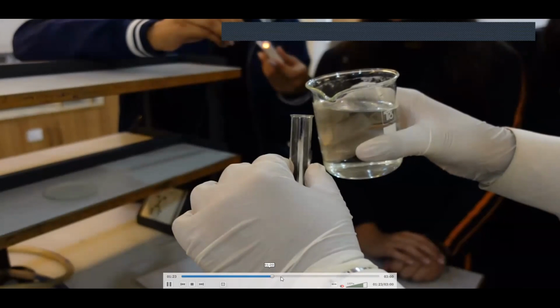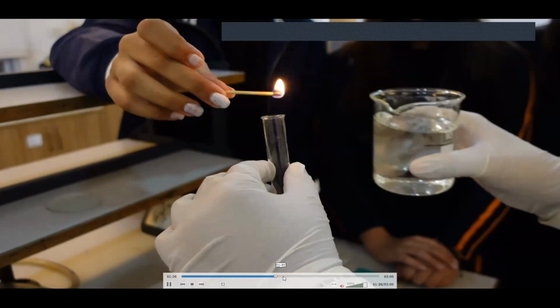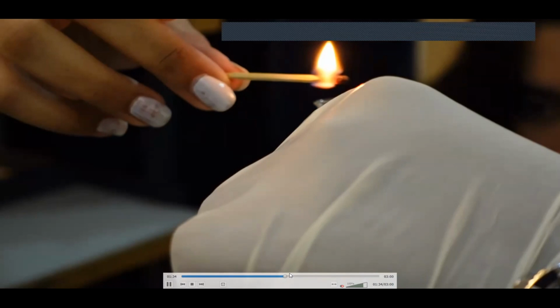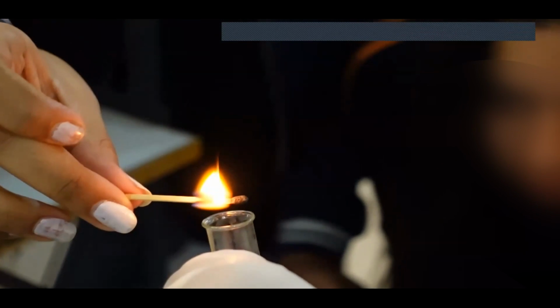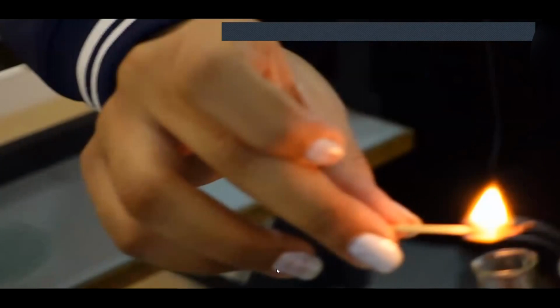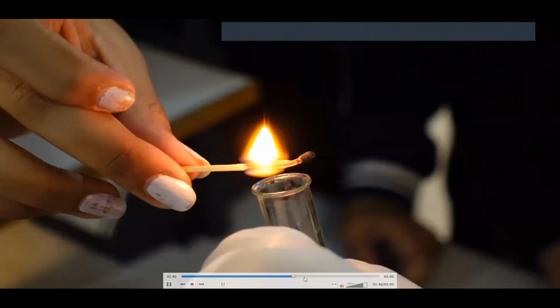So we wanted to test if the hydrogen gas was there or not. Lekin hame koi as such pata nahi laga. This is how you test for hydrogen gas, by the way. You take a burning splint and you bring it close to that, and there will be a pop sound because of this.